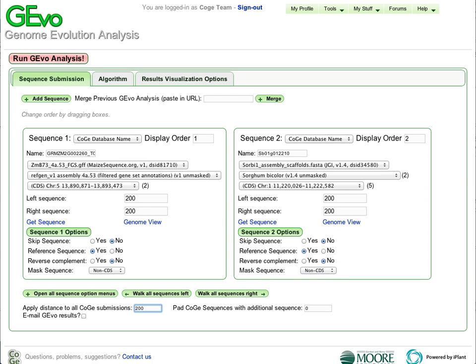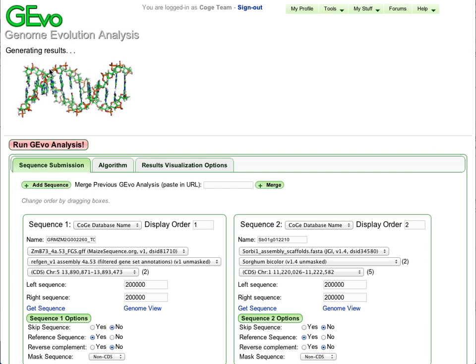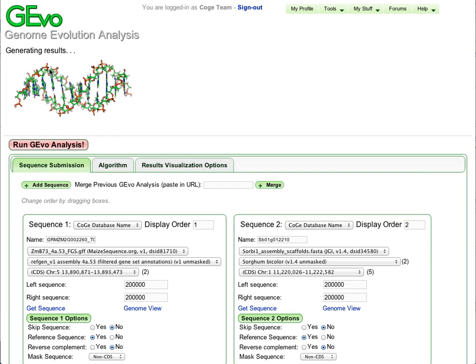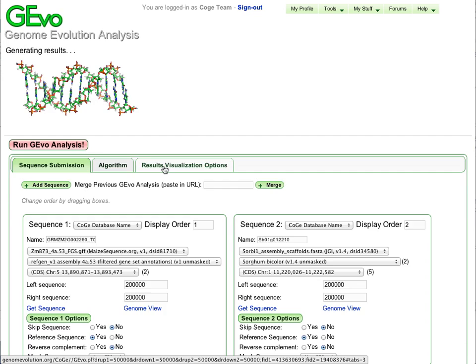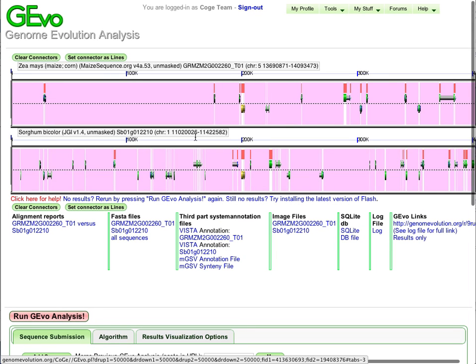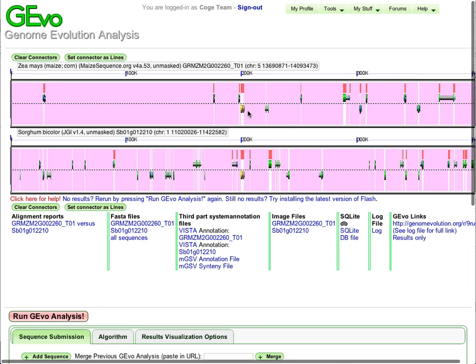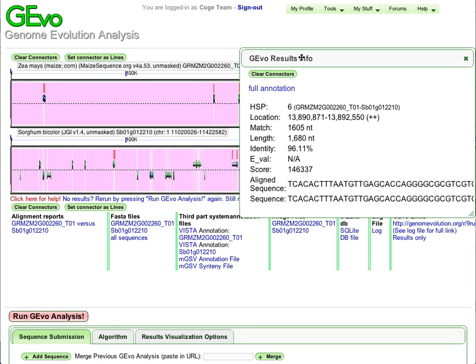In this case, I'm going to request 200 kilobases of sequence upstream and downstream from this particular pair of genes that I've clicked on. And I'm also going to be dynamically masking these regions so that we only compare coding sequences between the two regions.